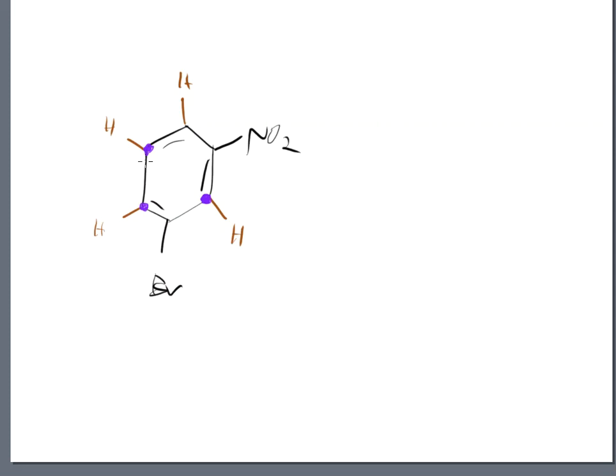So we're going to see another shift there as well. And again, it is different than the others because this is not near a bromine or an NO2 group. And then finally, as we work around to the 12 o'clock position, that's also going to be a ding dong because that is different than the other 3. That is now directly beside an NO2 group and no bromine on the other side directly. So that is a different type of carbon and different types of protons as well.